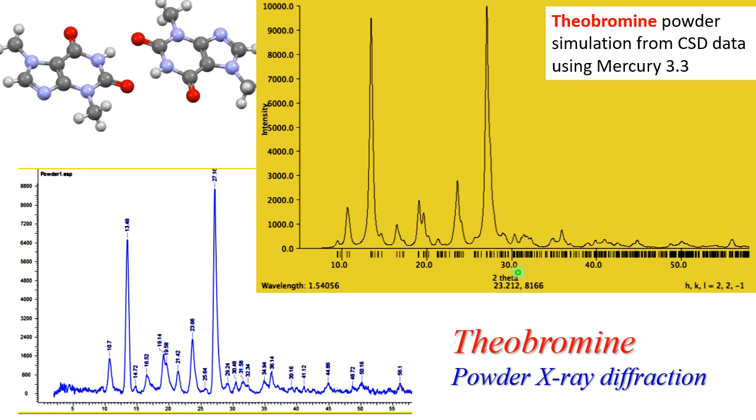These spectra can be relatively easily simulated, even for compounds that are not known in powder. So you are using a database, the software will make a simulation, and as you can see, the whole picture is very similar.